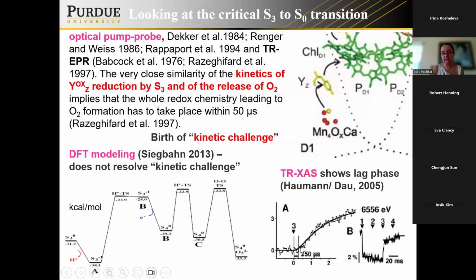So basically in this phase, we can collect the entire response, the entire representation of the electronic structure of the system, which is more informative. But in X-ray absorption spectroscopy, that seems to be like a lag phase, at least in those experiments. We were trying to redo those experiments with better detection of signal, but that was only partially successful. We had a limited number of people and resources, so we had to focus on something. Maybe eventually this will be redone at the modern level.